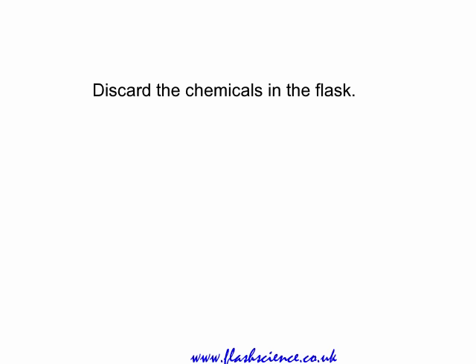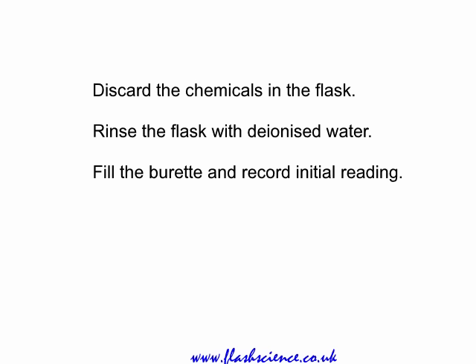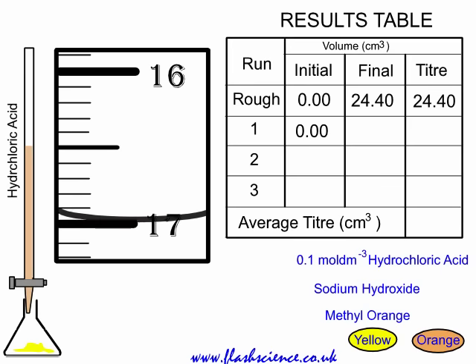We've got a good idea of where the end point is, so we now set out to obtain an accurate titer. You discard the chemicals in the flask and rinse the flask with de-ionised water — it doesn't matter if there's a little bit of water left. Fill the burette up and record the initial reading in your table. You know it's going to take at least 22 or 23 cubic centimetres, so just rush in the first 22 or 23 cubic centimetres of 0.1 molar hydrochloric acid. When you get there, slow down and add it in a drop-wise fashion, even a half-drop fashion, using a wash bottle to wash off the half-drop from the jet — the bit below the stopcock.